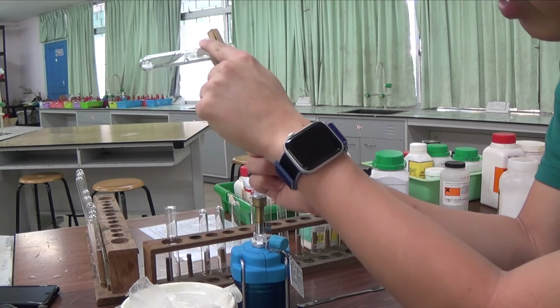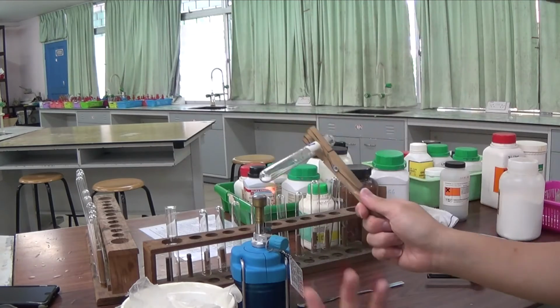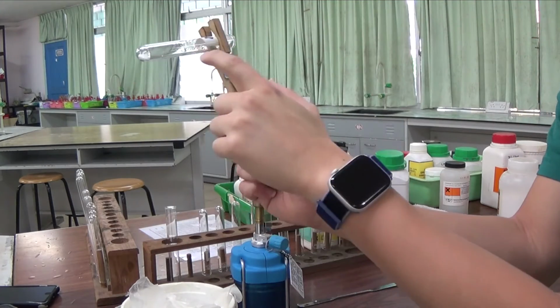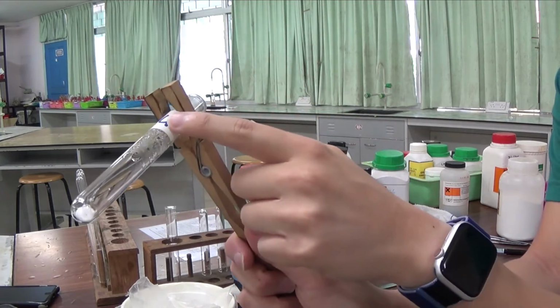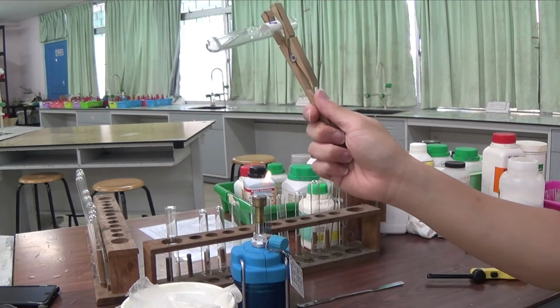That means you also need to heat this region with the water of crystallization in order to drive off all the water of crystallization. How can you ensure that the compound is anhydrous? Well, you need to heat until there's no more water vapor on the side of the test tubes. You need to be heating the solid until there is constant mass.